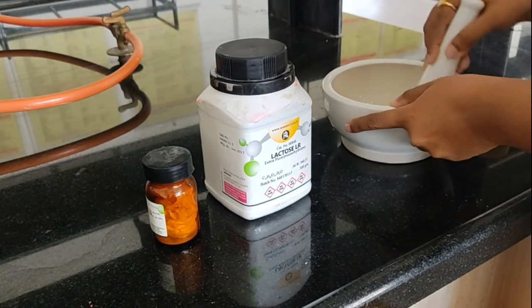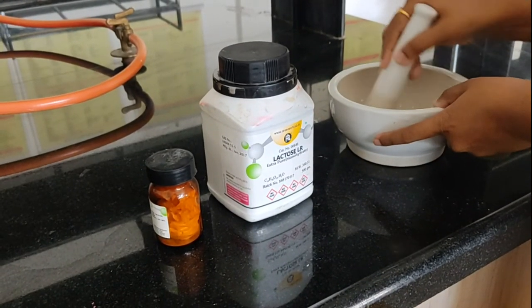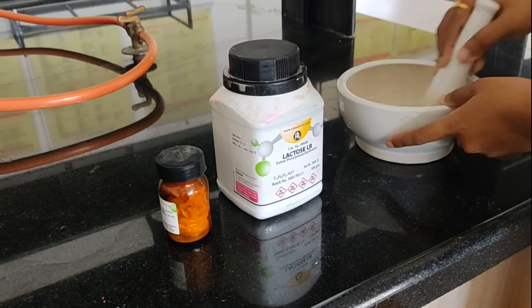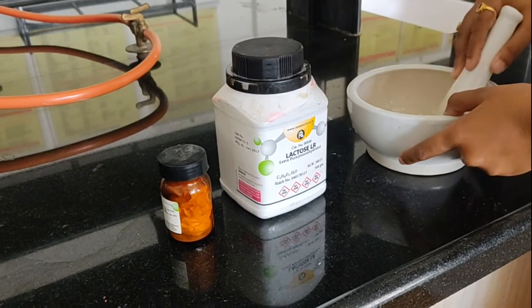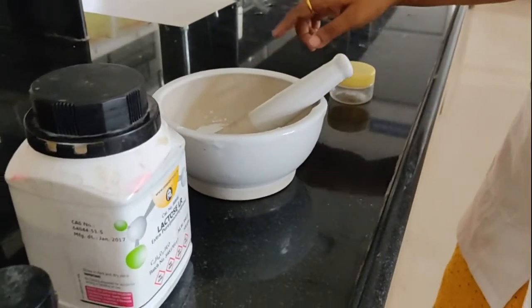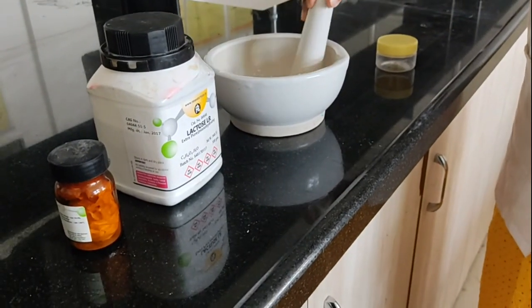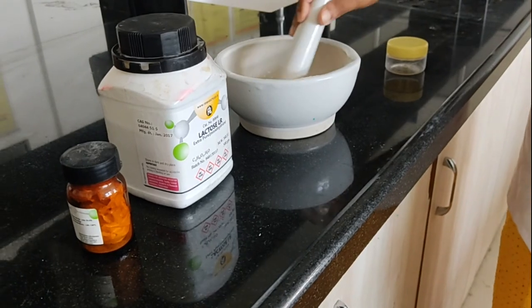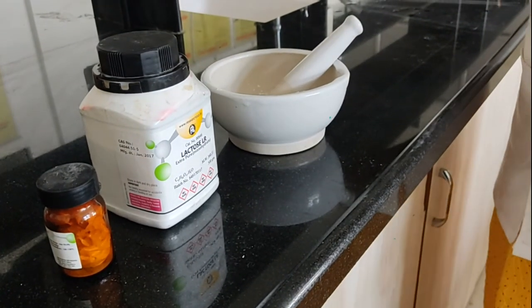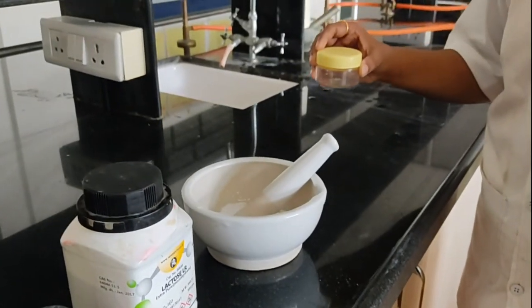After proper trituration of both the powders, I will transfer the powder onto the white paper for double wrapping, wrap each single packet, and after packing, transfer all the 10 packets into this wide mouth bottle, and then we will proceed to the labeling part.